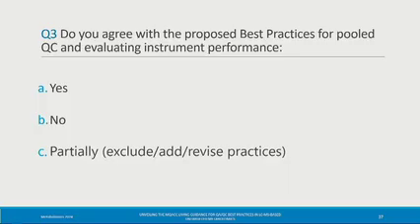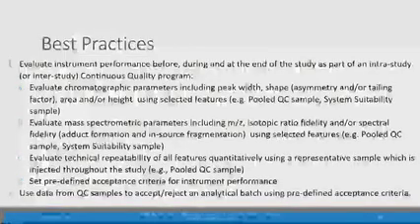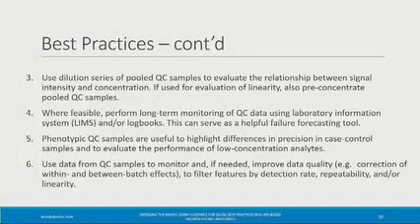Question number 3. Do you agree with the proposed best practices for pool QC and evaluating the instrument performance? Again, A, yes, B, no, and C, partially. You might want to exclude, add, or revise any practices. And as a reminder, those are the best practices, which are the same as the minimum practices, and those are the different ones.